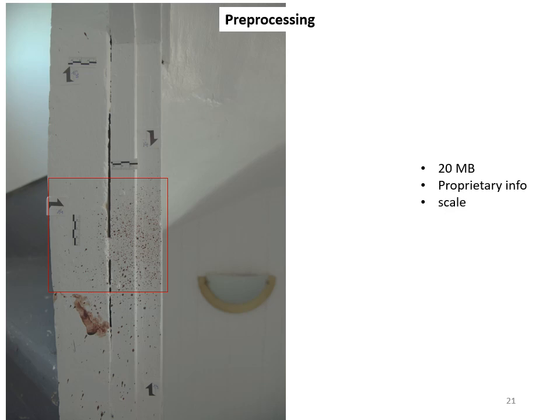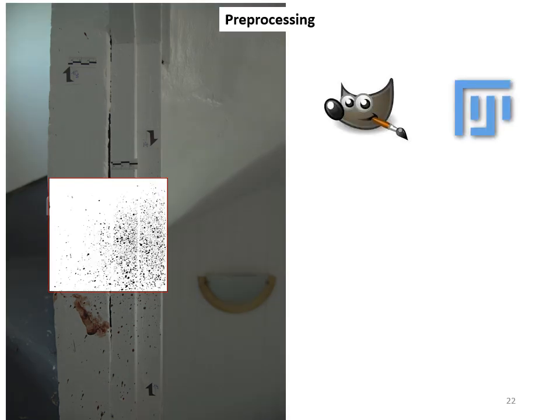So what you need to do before submitting the data to the software, you need to work on that picture, to threshold that picture so that you give to the software a picture where the black regions are the stains and the white region is anything else. And the best tool to do that is not to get a new software, it is to use what has been proven and used for decades by our community. So you might be familiar with Photoshop.